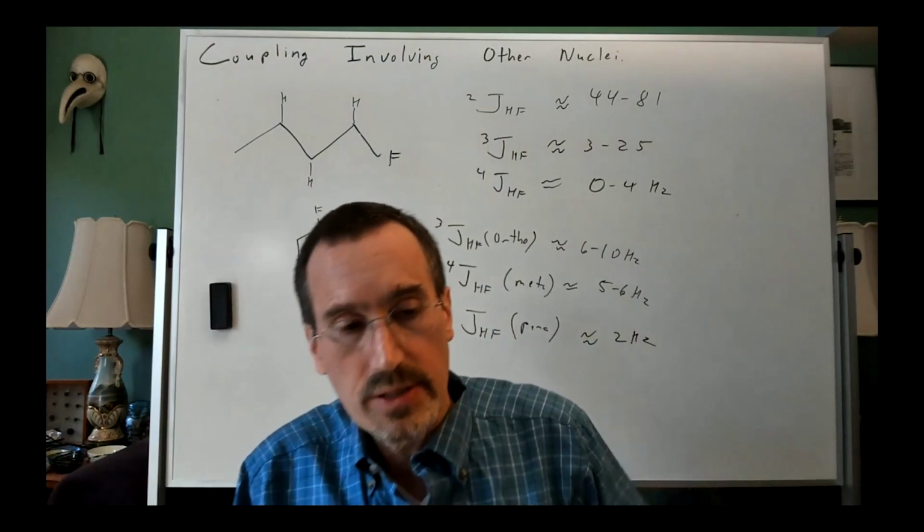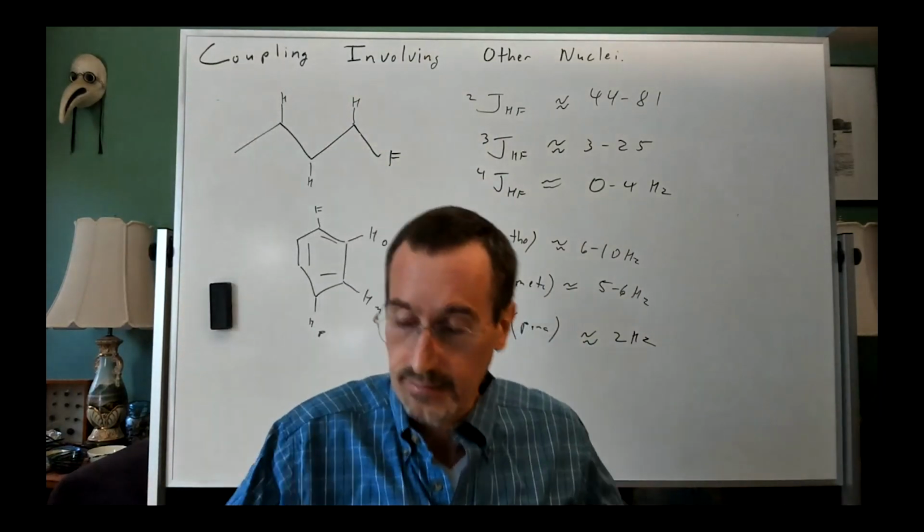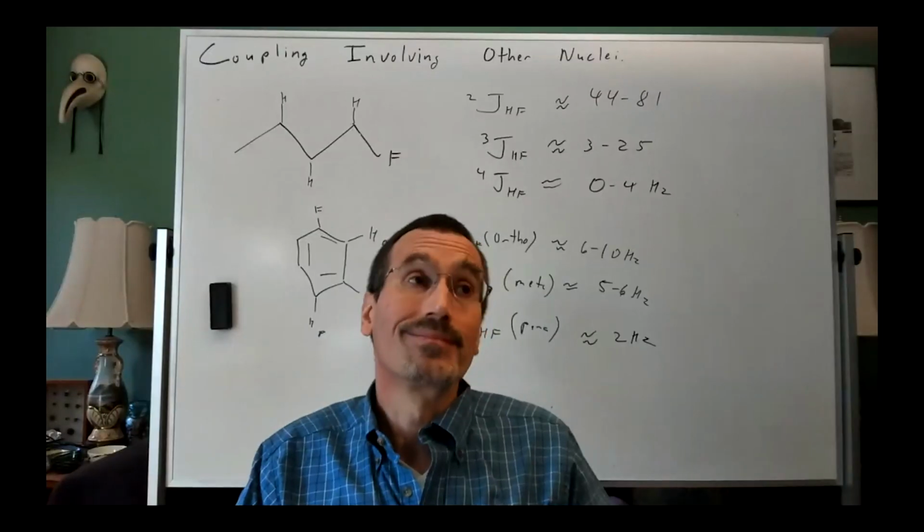Thoughts or questions at this point? I guess, do you have any tips and tricks to be able to identify between normal proton splitting versus proton fluorine splitting, aside from coupling constant, I guess?